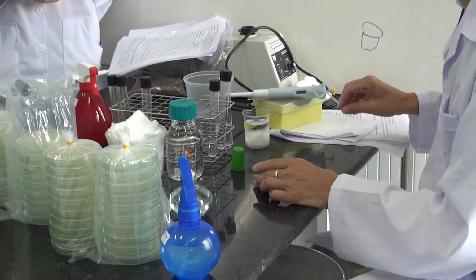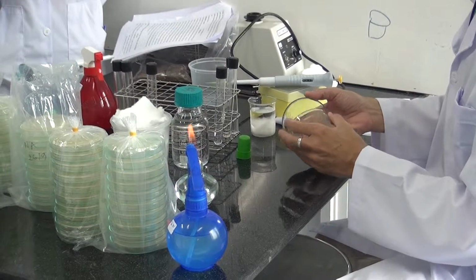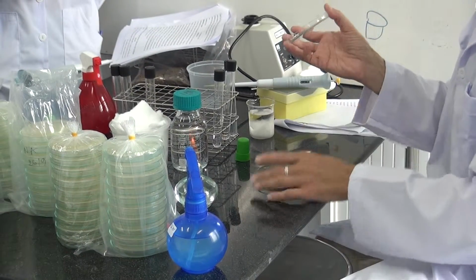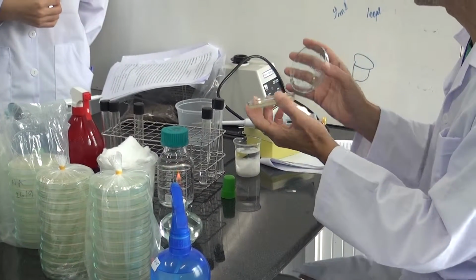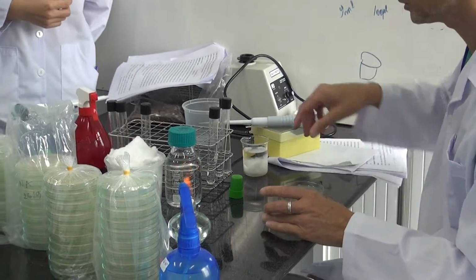Okay, the water can drop down from here. The water, since it's condensate, it can drop down. It's not necessary because this is supposed to be sterile, right? So this is just sterile water. Not only contaminate, it can be a contamination, but also in the end, what you would like to have, let me just.